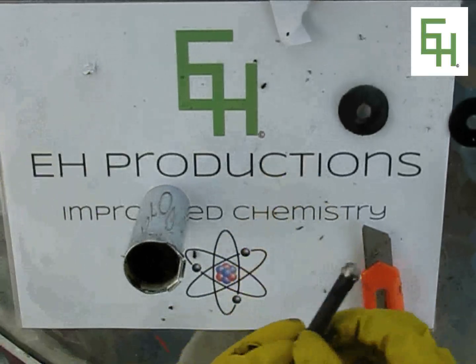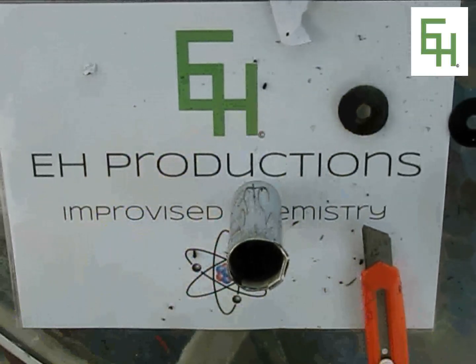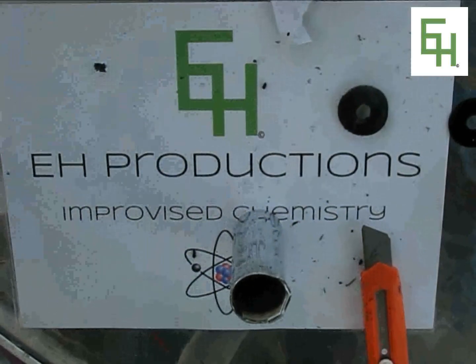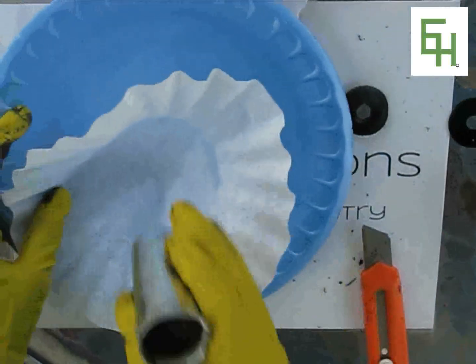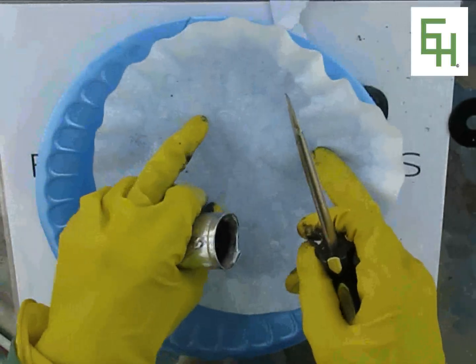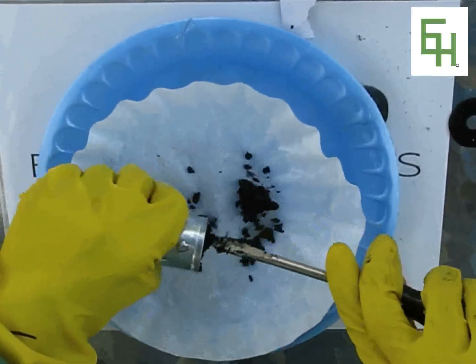That's the tar — just laying on there, we're going to put that aside. Inside here is all manganese dioxide; I'm going to get that out in just a second. I got my coffee filter right here. We're going to get a coffee filter and also a plate. We're going to use our screwdriver — it's really windy today. We're just going to take all this out.